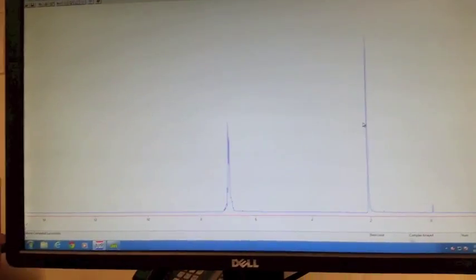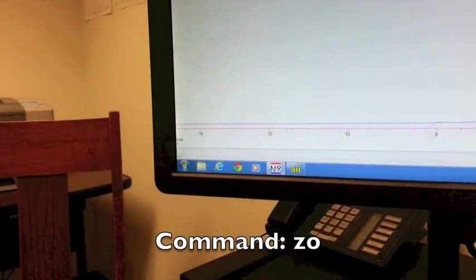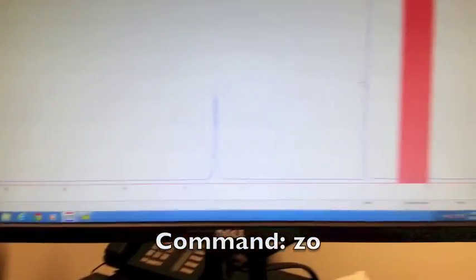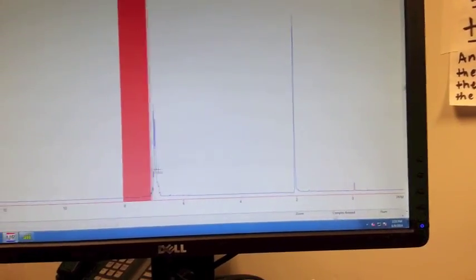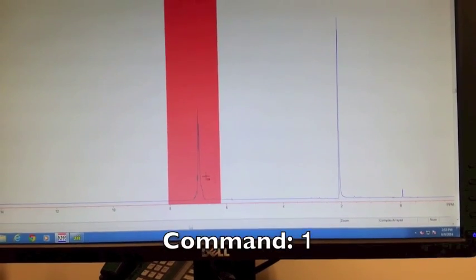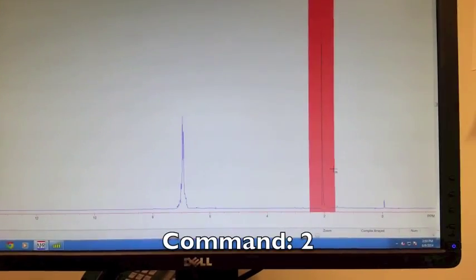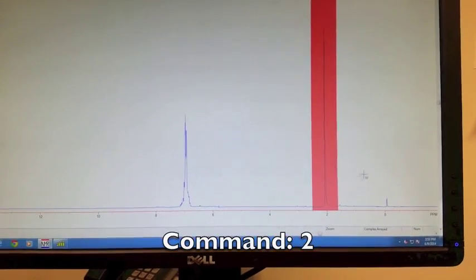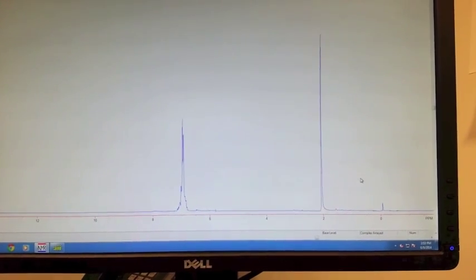First, what you want to do is enter the zoom routine by typing in ZO. You want to highlight a strong peak on the left side and hit 1, and a strong peak on the right side and hit 2. Then you can hit enter.